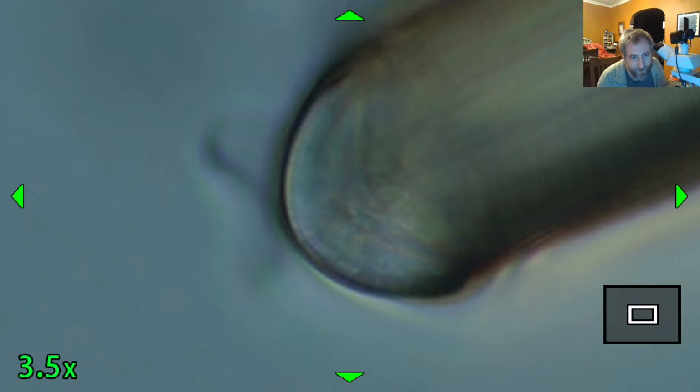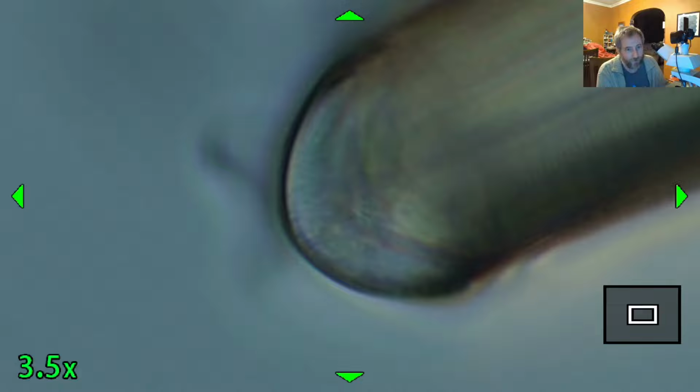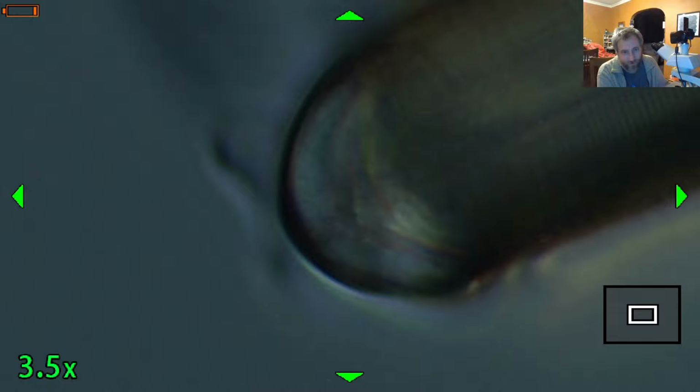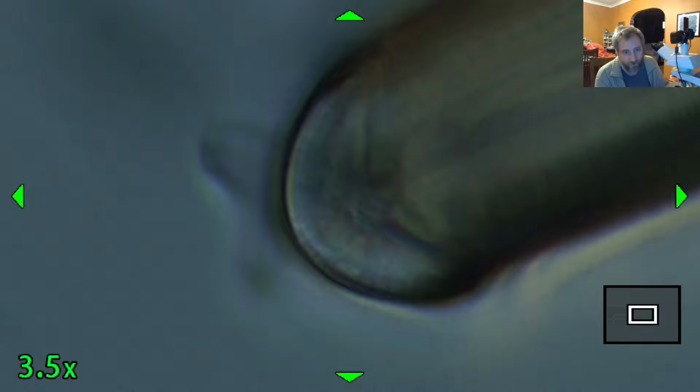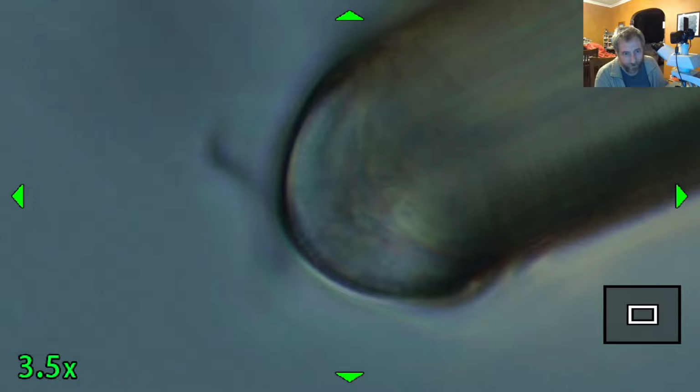You can do a trick, which is basically distort the light by putting your finger down here, and it changes. The light kind of wraps around my finger, and you can probably see those little pores a little bit better. In the old days, you can also do it with a pencil if you don't want to put your finger in there, or I'm using a Sharpie. You just put that in between the light and the objective, and it creates these sort of shadows, and the light wraps around the obstruction and creates oblique lighting, right? So we can get some oblique lighting in here, and then some of those little pores will stand out a bit better, right? You can maybe see them a little bit better.